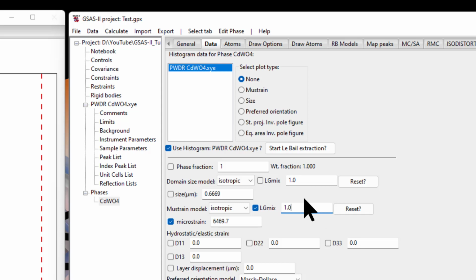If you use the software with the new updates, it becomes more user friendly, and the creator is trying to improve it further so that even a first time user can easily go through each and every step and try to improve his refinement.